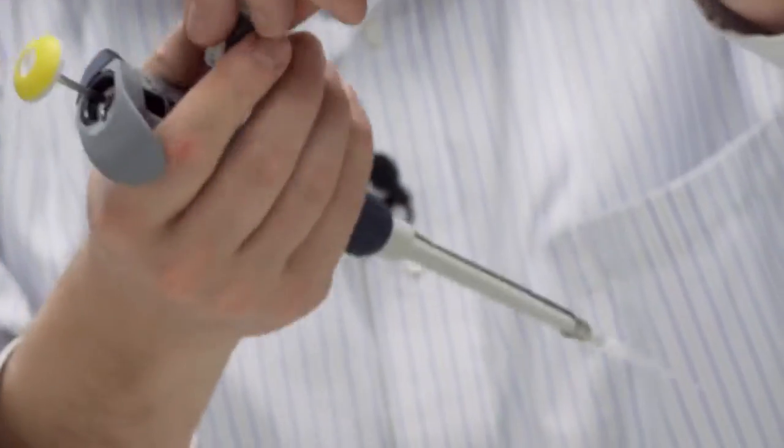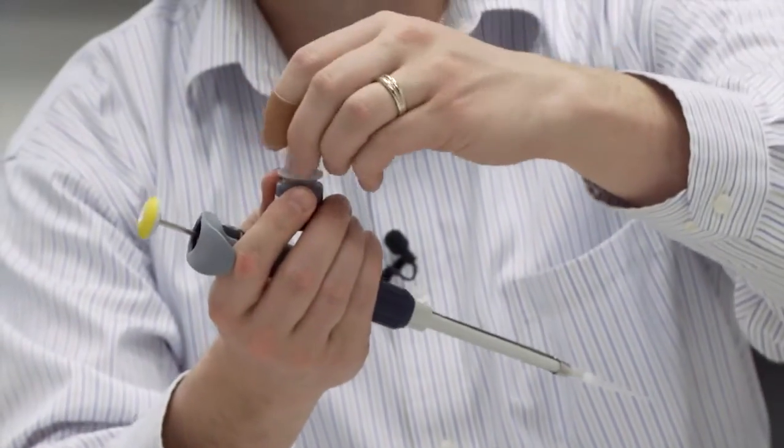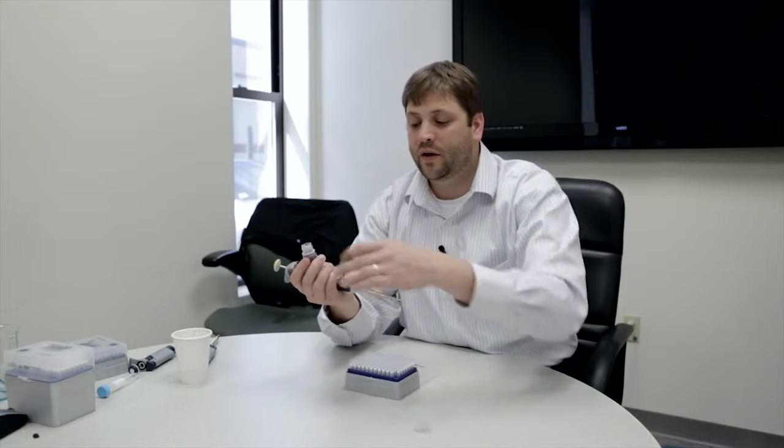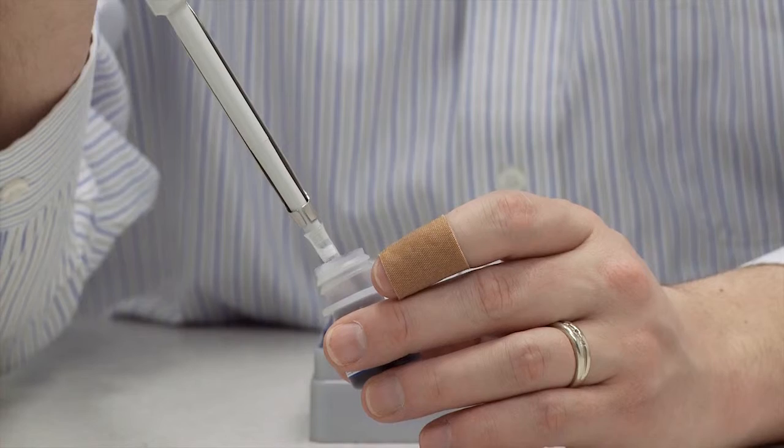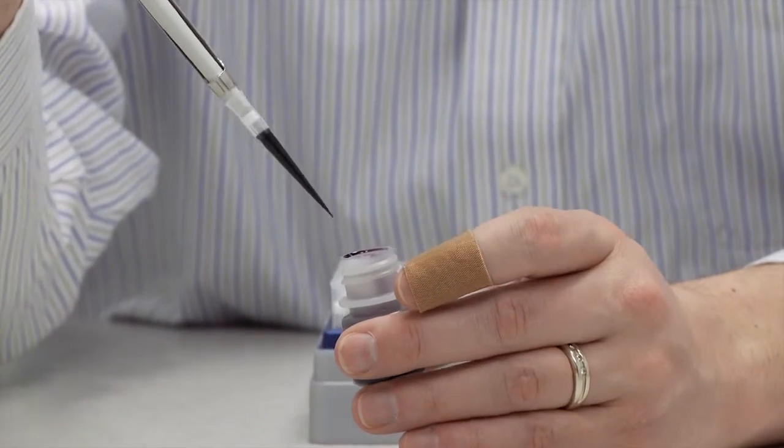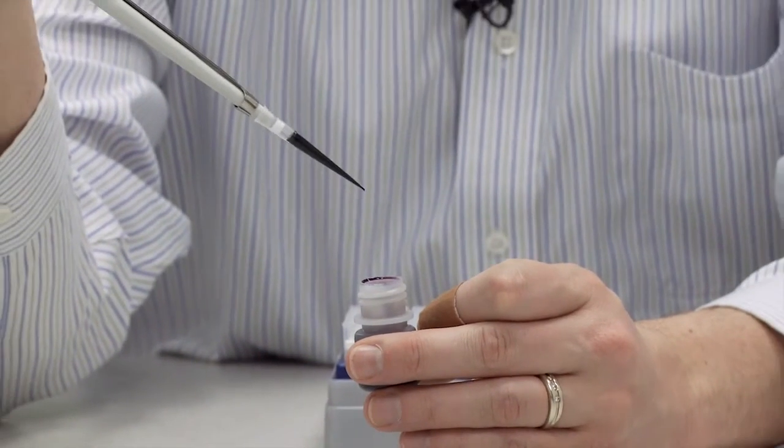And what I'm going to use this time is a 6x loading dye. This is a very viscous material, just to demonstrate a point of the quality of the plastic Denville Scientific uses. I take a draw of this 6x loading dye into my pipette tip.